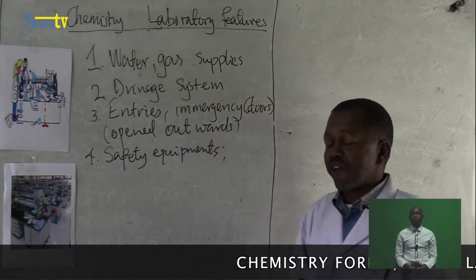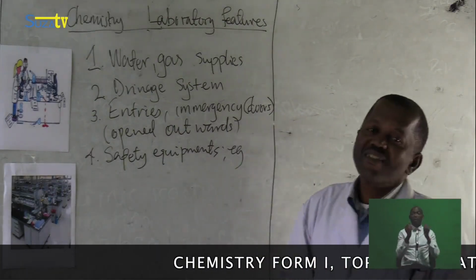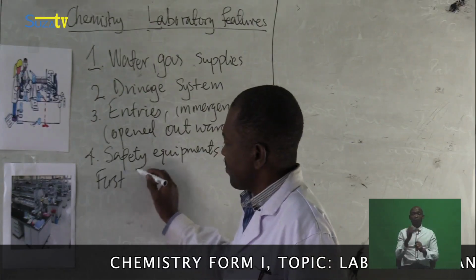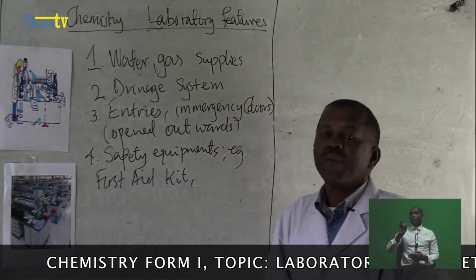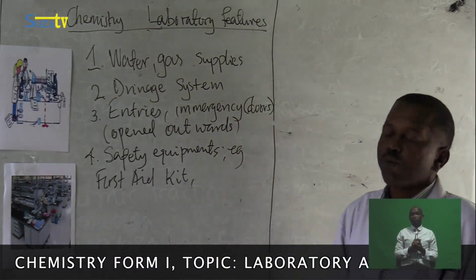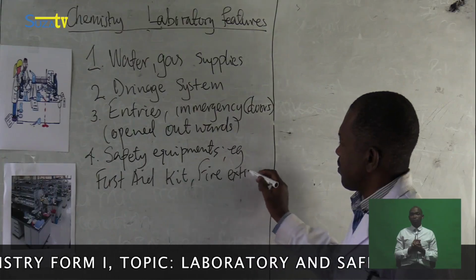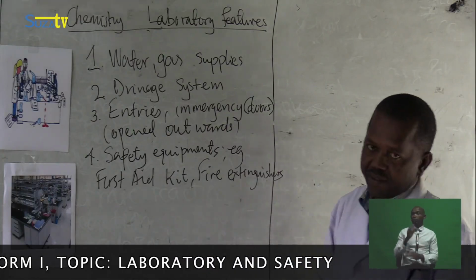This safety equipment, for example, we have first aid kit. We have fire extinguisher. And others.